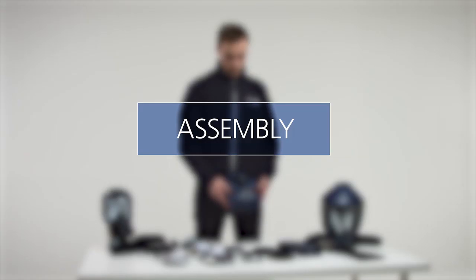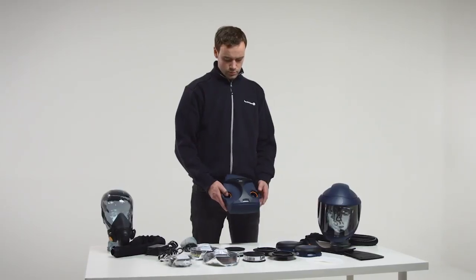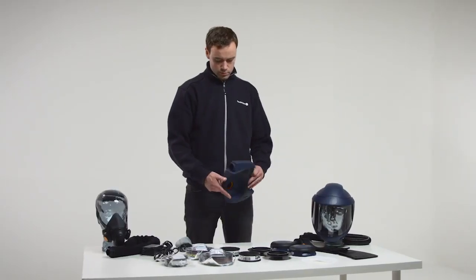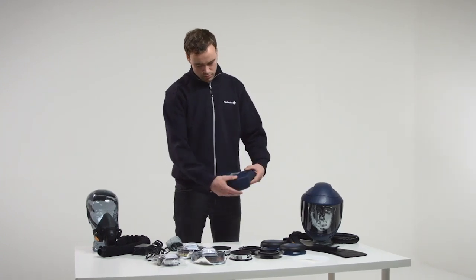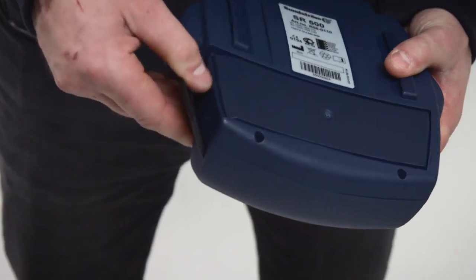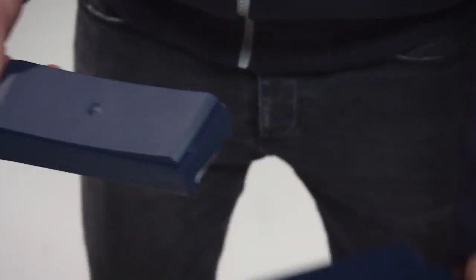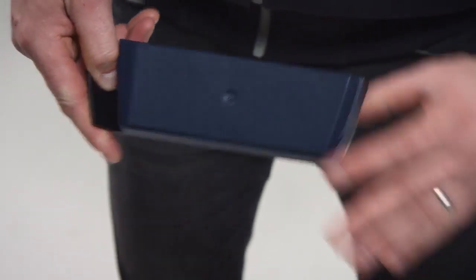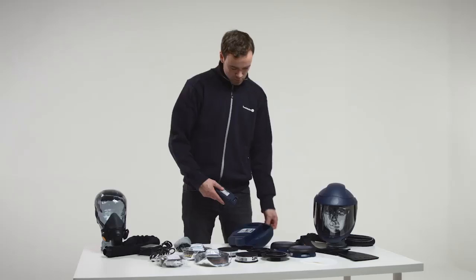Assembly. On delivery, the battery fitted in the fan unit is provided with protective tape over the terminals. Remove the battery and remove the tape.